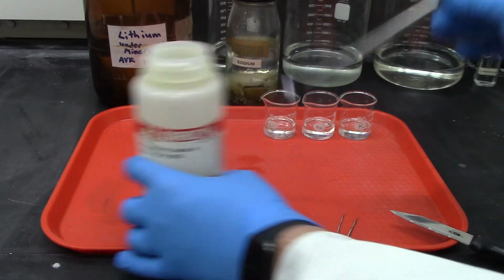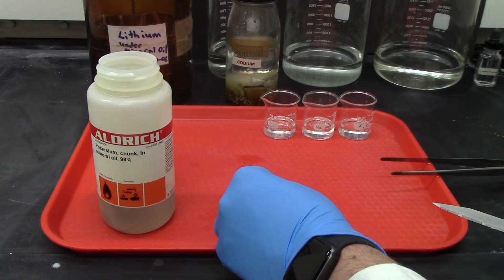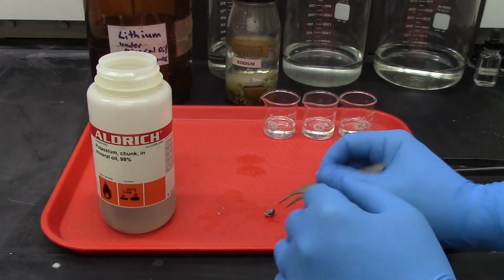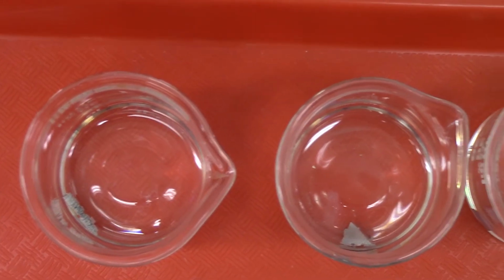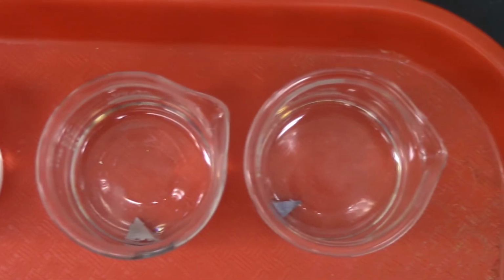The potassium looks a lot like the lithium and sodium, and I did the same thing here, cutting it into a smaller piece and placing it into toluene for later. After cutting, I have 3 similarly sized samples of lithium, sodium, and potassium in toluene.